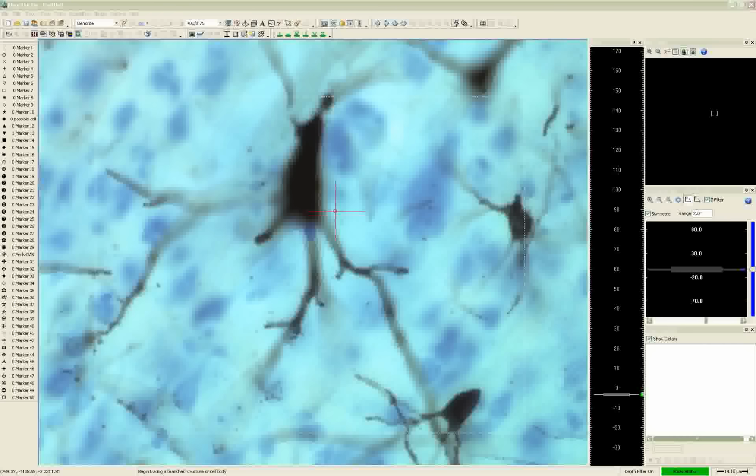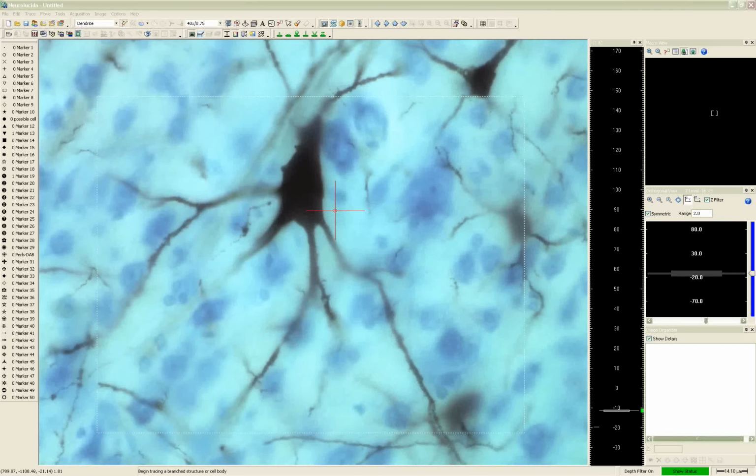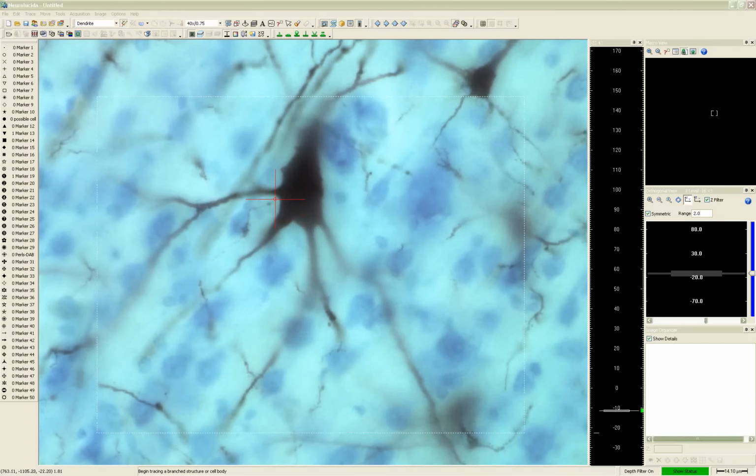And okay, so let me trace a couple more branches just to see if there are other things that come into question. If you don't care about the axon, you don't have to reconstruct it. Likewise, if you don't care about spines, you don't feel that you have to reconstruct them just because you can see them. However, if it's something that you want to include in your analysis, clearly, if you see it, you need to trace it.